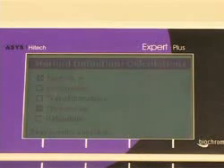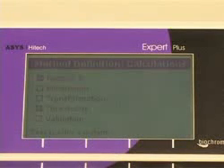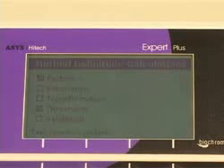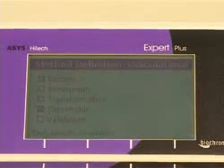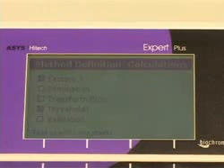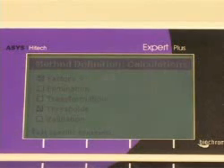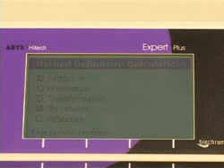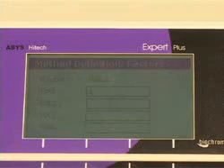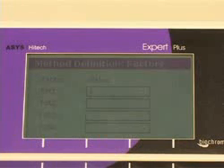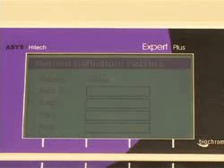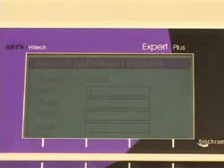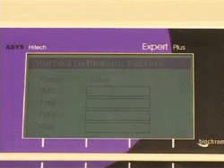The user can set up what calculations are to be carried out on the collected absorbance data. Factor allows simple concentration measurements to be carried out. Transformation allows inter-well calculations. Thresholds allows pass-fail checking and validation checks for test validity.